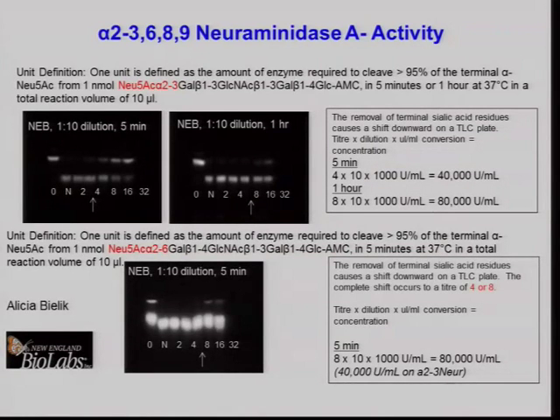And so, as I say, we had a collaboration with New England Biolabs because we were really aware that lots of enzymes on the market are not very clean. We know that, so we always test our enzymes, and we're aware that they may have secondary activities. But if you're just coming into the field, it's hugely confusing. So over the last couple of years, New England Biolabs have made all the major enzymes for N-glycan analysis recombinantly. That meant they had to grow an almond tree to make almond tree fucosidase. So this has been a huge project. But now they have all of these enzymes, which are clean of other enzymes and also properly characterized.